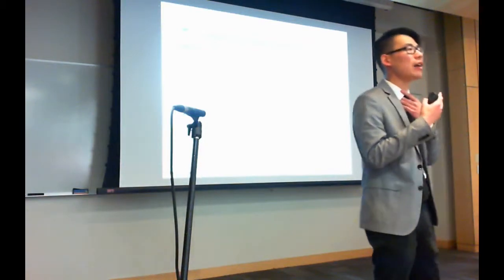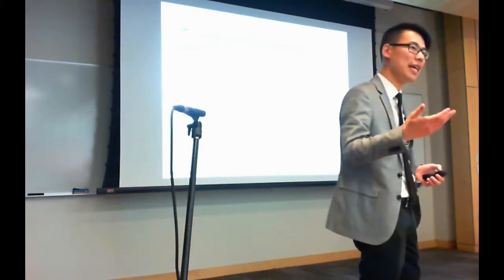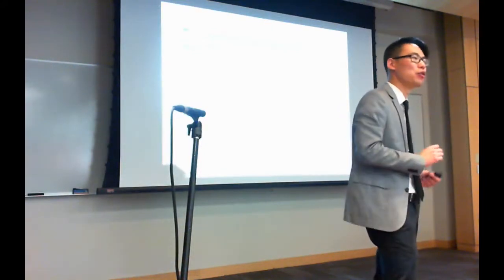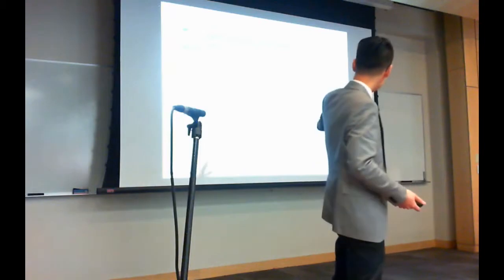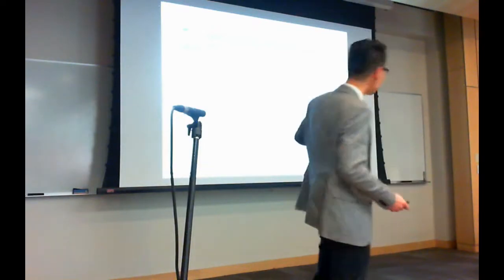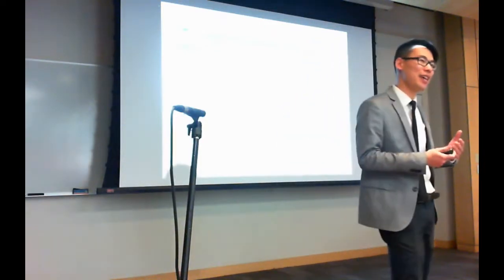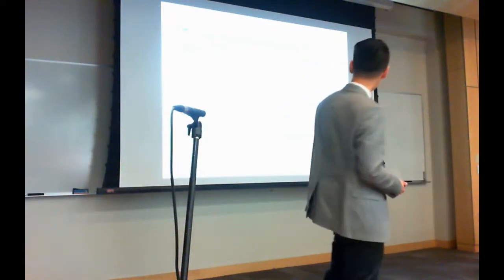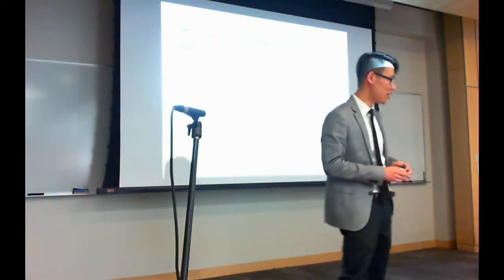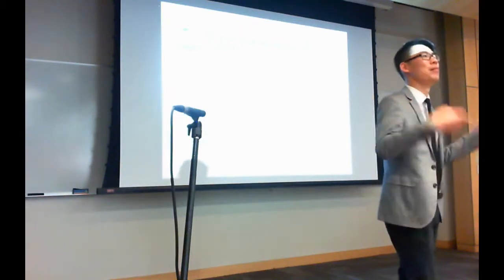But what if we can not identify everything exactly, but give a hint at the rest of the data, at what potential structure it could be, or some parts of the structure? And so what we can do, and we'll show in just a second, is we can get 10% of the data, so 5 times more data, with a hint at the structure. And the way we do this is creating molecular networks. I'll just give you a taste of how we create these molecular networks from the bottom up.